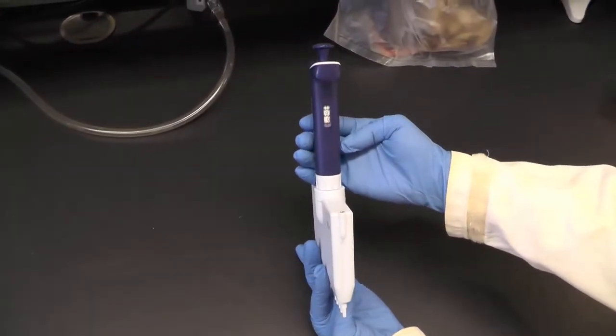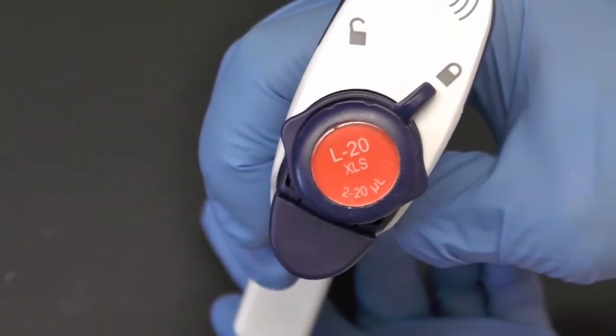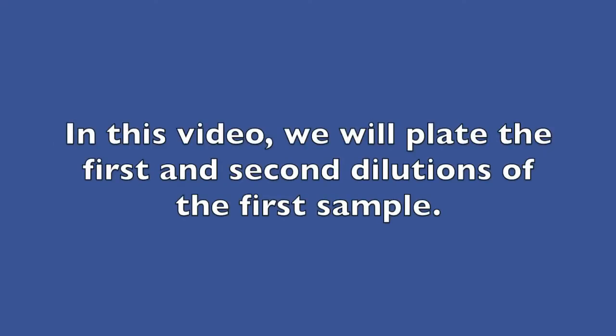Set the volume of a 2 to 20 microliter multi-channel pipette to 10 microliters. You can choose which dilutions you want to plate. Here we made three dilutions for four samples and we will plate the first and second dilutions of the first sample as an example.